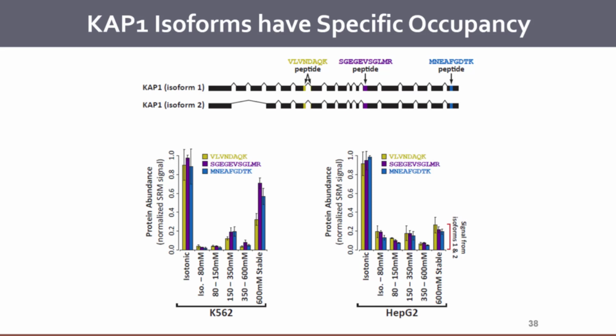And he repeated this experiment about a dozen times, knowing Andrew, that's the way he often does it, and he still couldn't figure out why this one was so much lower than the other ones. Partway through this project, ENCODE released all their RNA-seq data, and in this K562 cell line, they noticed there was another third alternative splice form. Now notice this peptide's not present in that one.